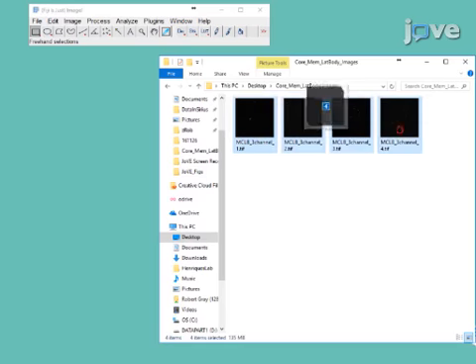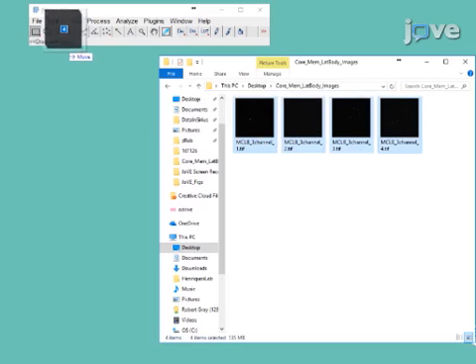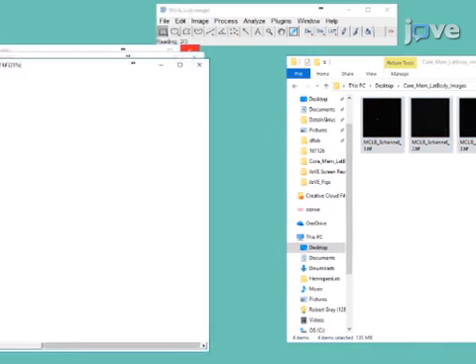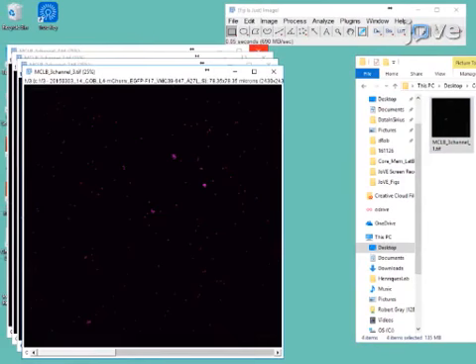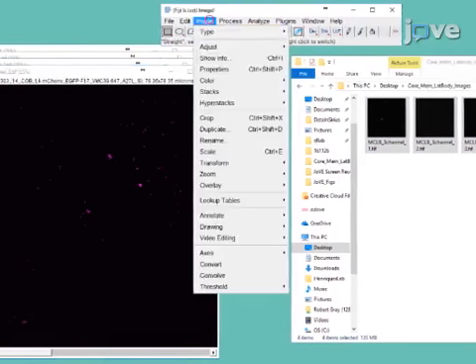Once the images have been obtained and processed, import and concatenate the images into a stack with intercalated channels.